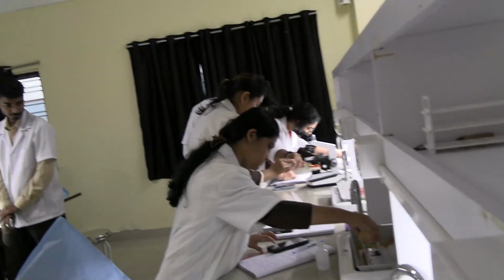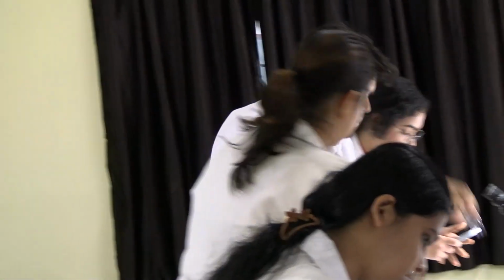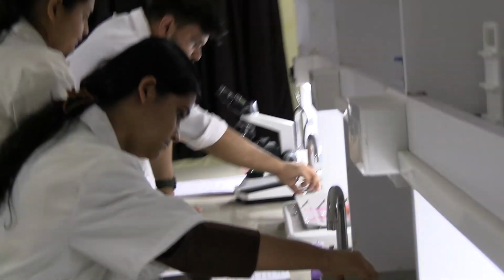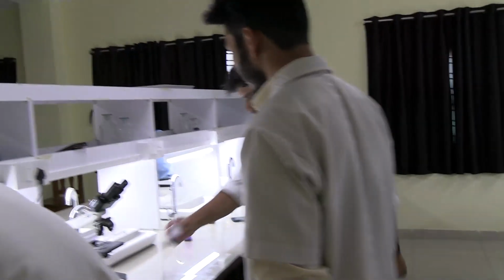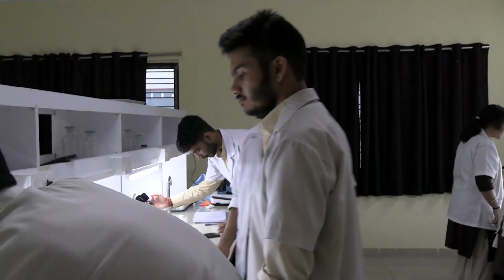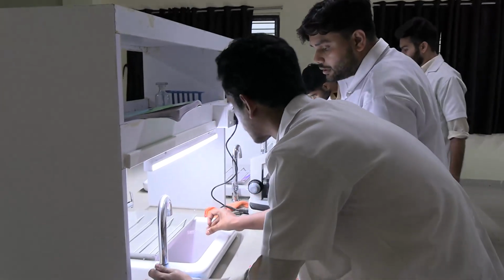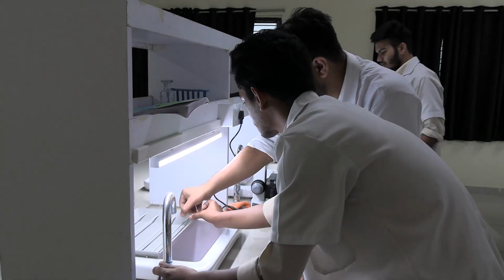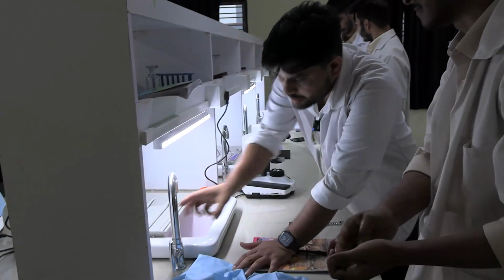30 seconds gone now. I think yours is washed away a little bit. Okay, we're gonna wait. We'll wait for the excess water to dribble down. Safranin, where is the saffron? This is the saffron. Okay, counterstaining for 30 seconds. Okay, let's go. Don't wash away too much, otherwise the whole smear is gonna get washed away. I think that's enough. Now what to do? You've done the counterstaining now? You're just gonna place it here to let the excess water dribble down.